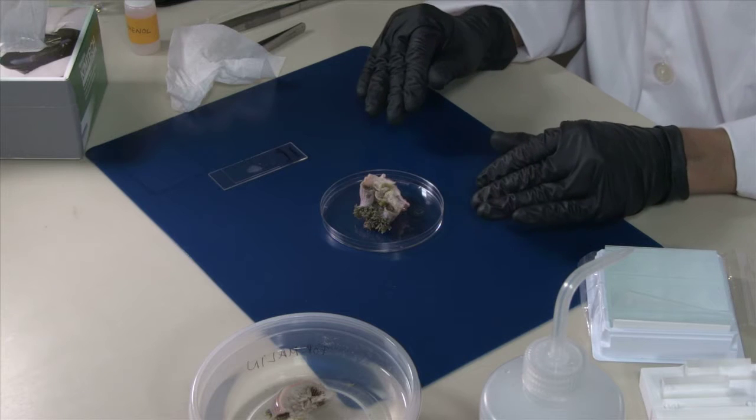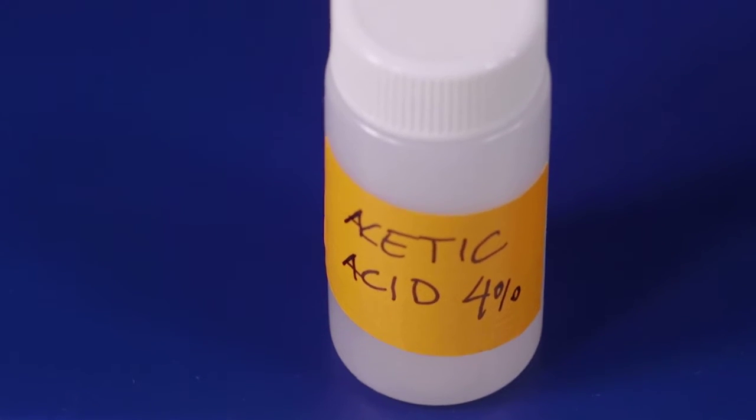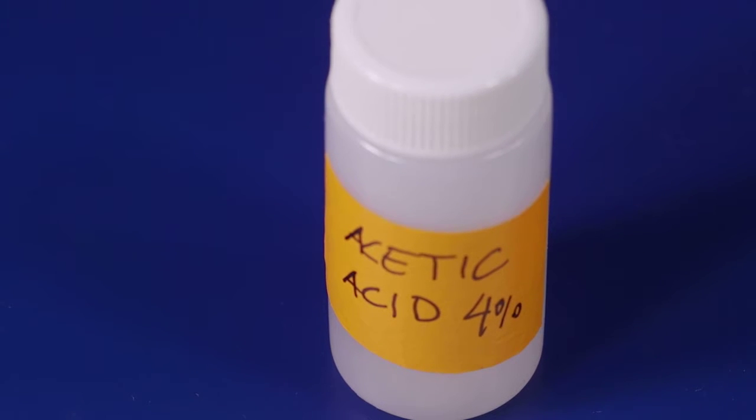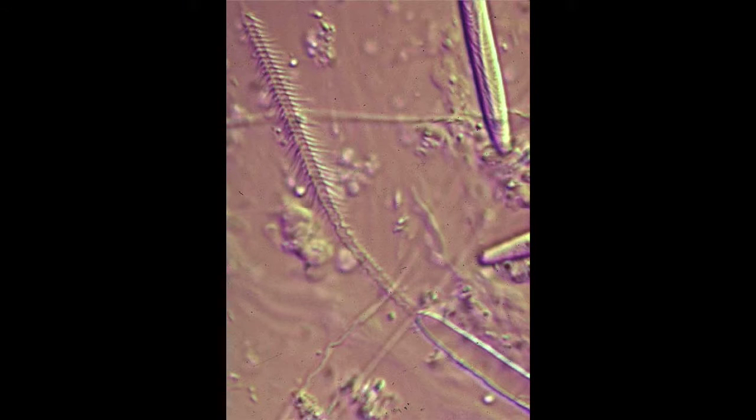In order to distinguish some types of cnidae, you need to observe the capsules discharge. For this, it is good to make a cnidae preparation from living material. The procedure is the same. However, we will have an additional step in which we will add a drop of acetic acid solution at 4%, which will help discharge the cnidae.